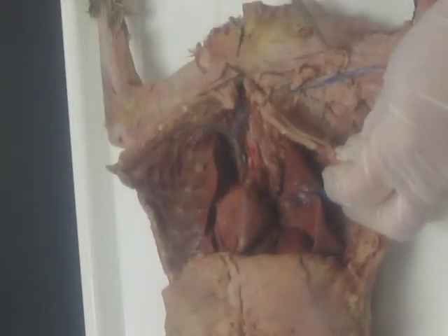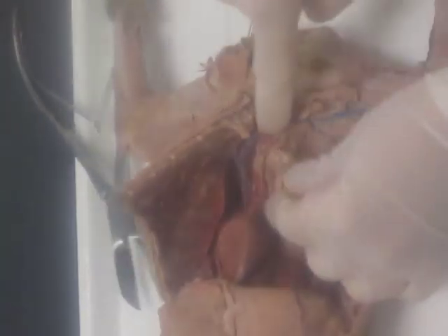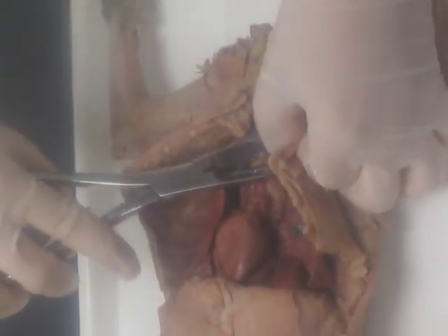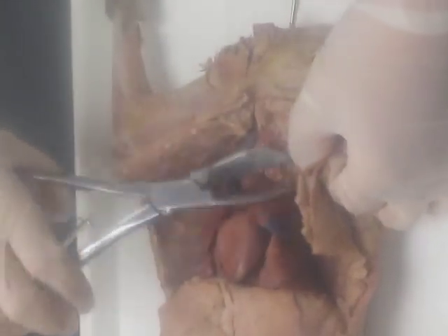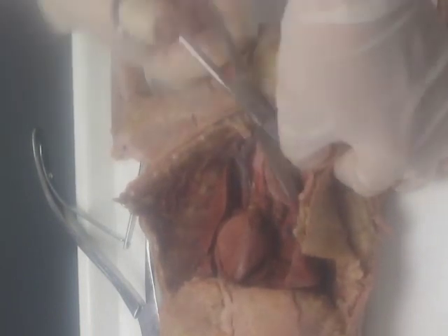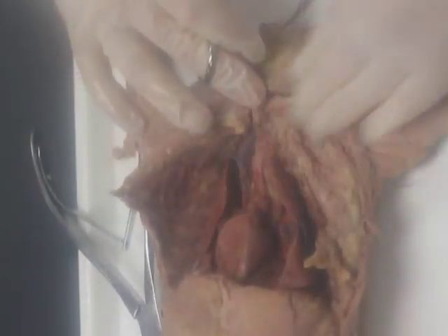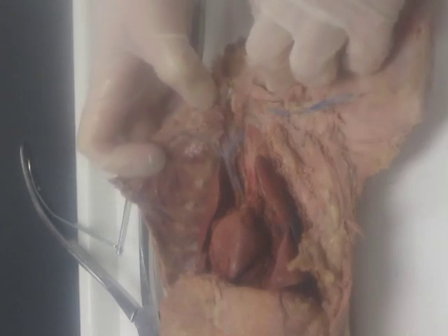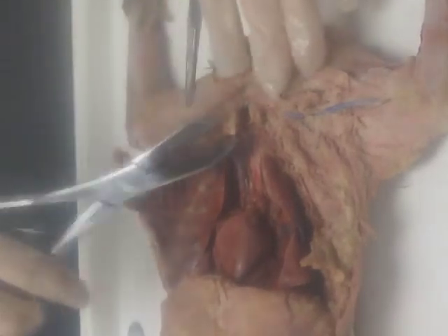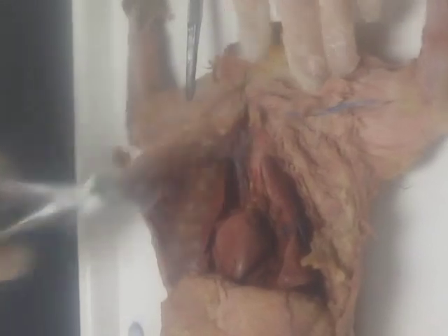Now we're going to start heading down the upper limb. I've cut that first rib — feel free to cut some of this ribcage out of your way so you have room to identify your vessels going down the left arm. Call me over and I'll cut through a couple of ribs for you, or by now they may be soft enough to use scissors. We're going to identify the brachiocephalic veins first because veins are more superficial, and once we've uncovered all the veins, arteries are easy.